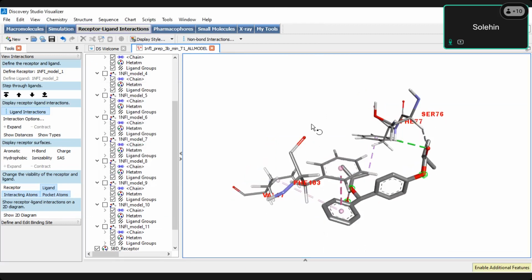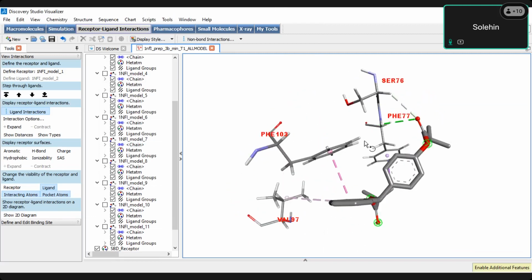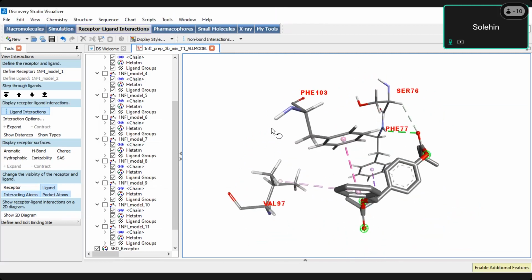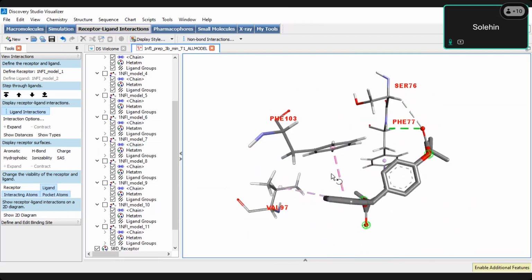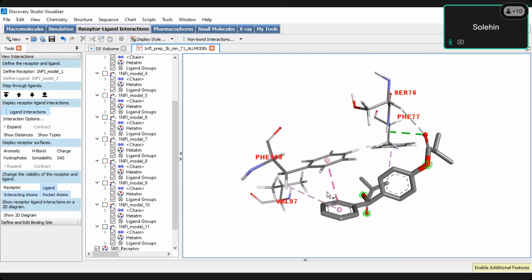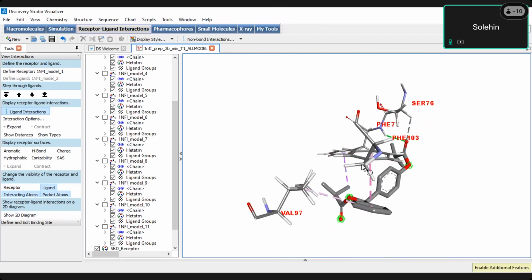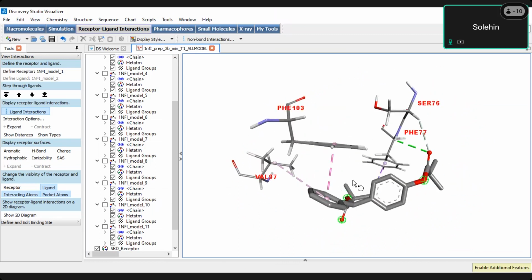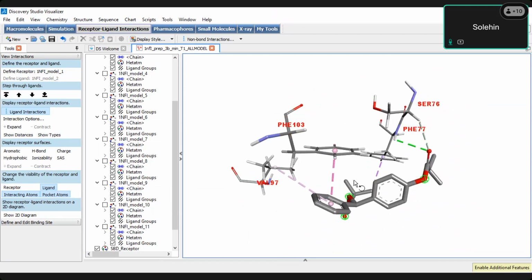Before you save this 3D form, please make sure that your graphic, the conformation is good, besides that we can see the name of the residue, and we can see the structure of the compound. Like this one, I think it's okay because we can see the interactions. But it's really up to your preference. I don't limit the preference. I think this one is good because we can see the protein, the amino acid residue, and also the compound.